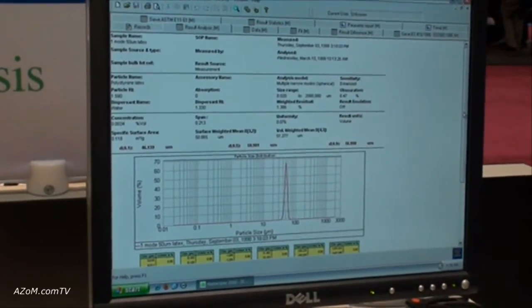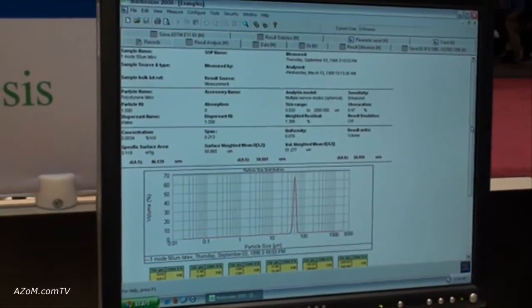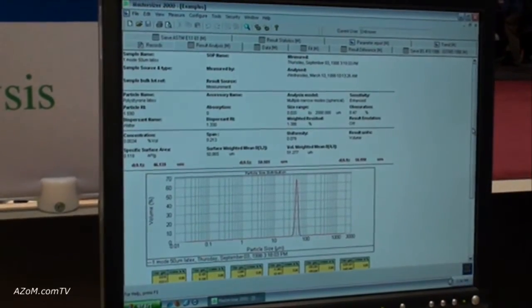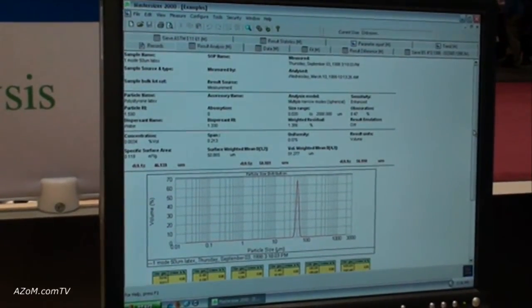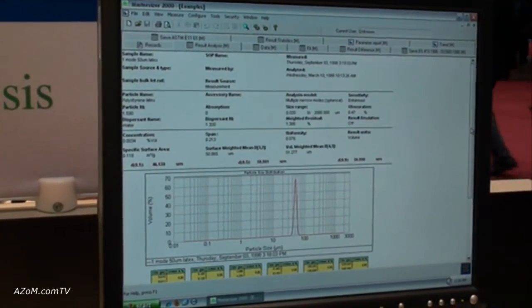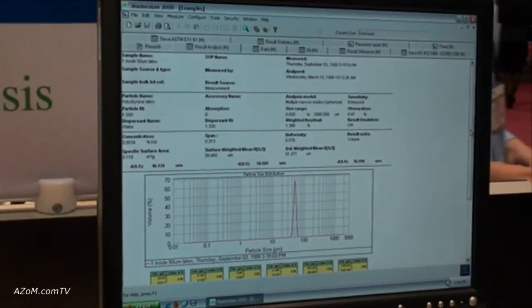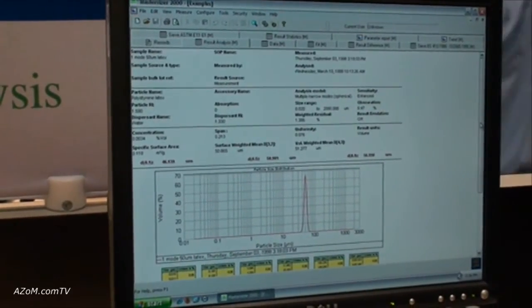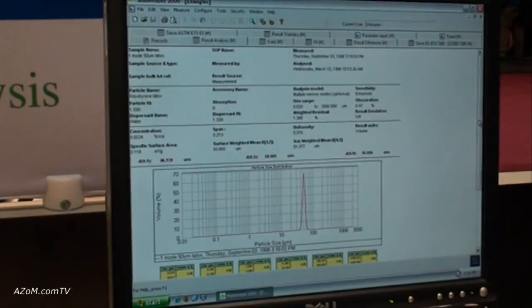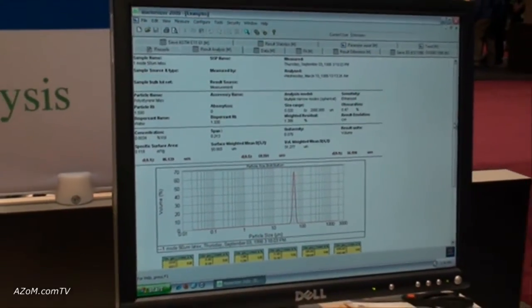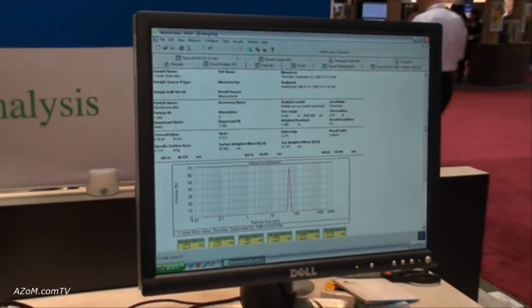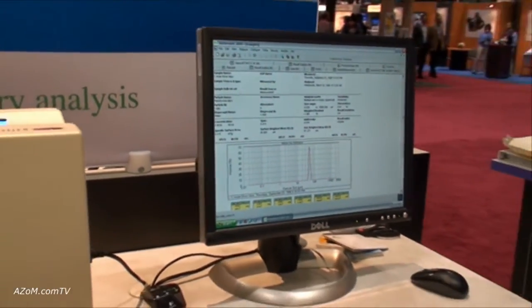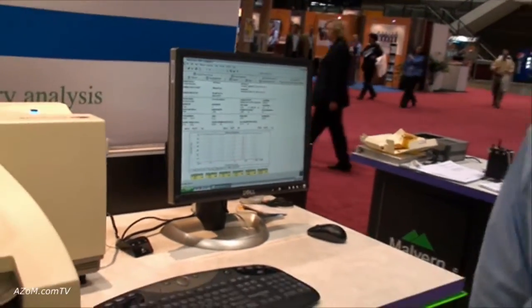It's very easy to export the data instantly into a program like Excel, for example, for calculations in a different software program. The software is FDA Part 11 compliant, which is typically required in the pharmaceutical industry. We also offer free software upgrades over the internet, so it's very easy to keep current with the latest software that Malvern offers for the Mastersizer 2000.